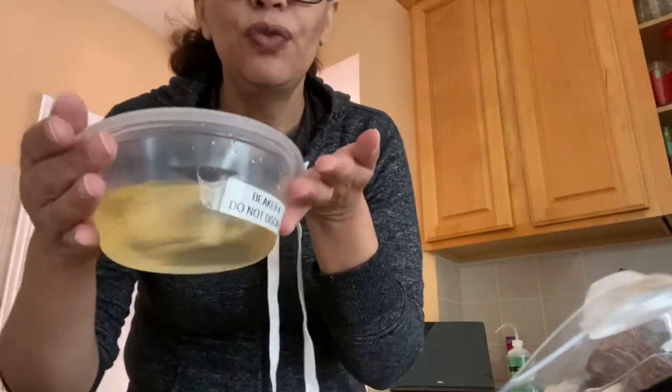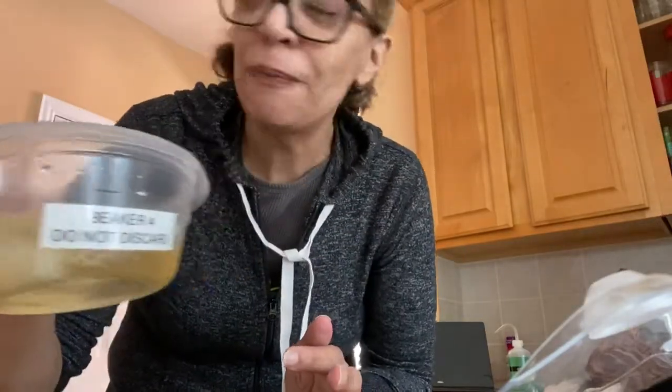If we want to know that a potato has starch, we put one drop of iodine, and it will turn black blue. Well, the same thing. We are going to see the iodine diffusing inside of our artificial membrane and turning black blue. This is an artificial diffusion. We will leave it for 30 minutes. And during this time, I'm going to prepare a different bag to study the osmosis.